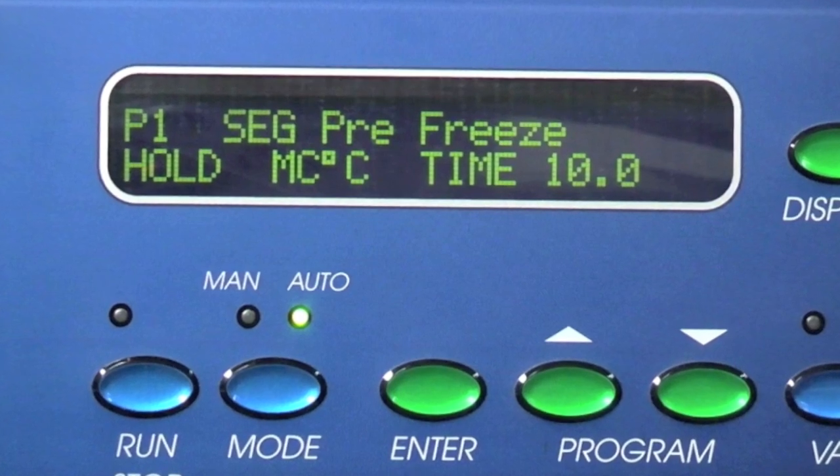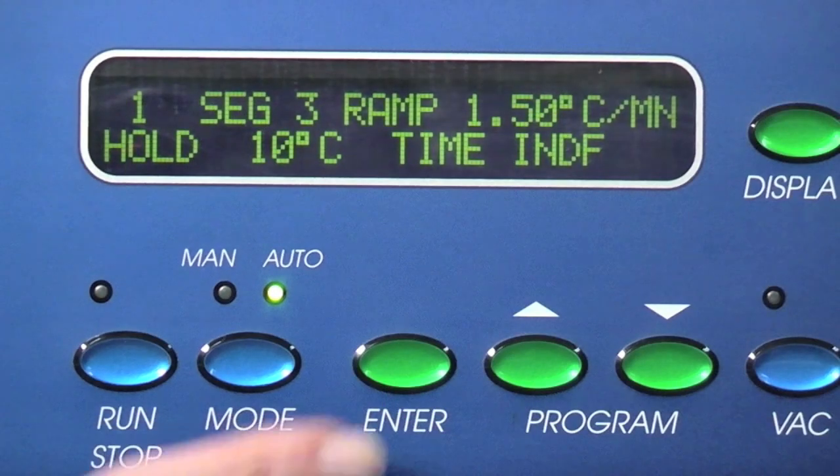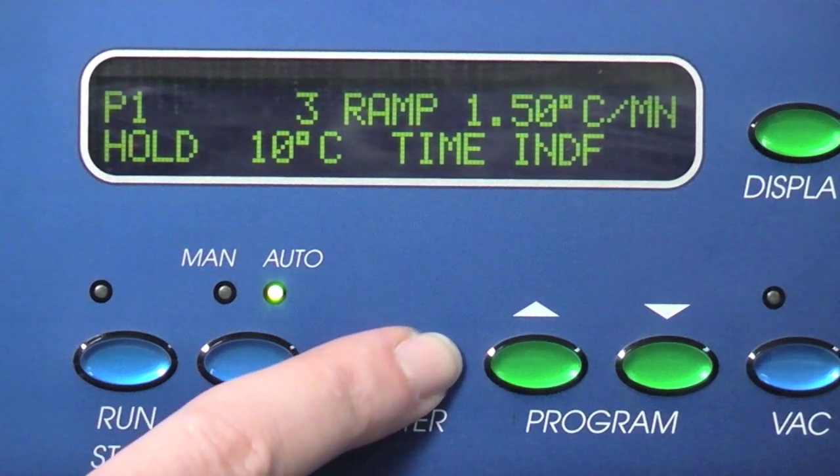The display will show the parameters that were last entered for this program. Push the enter button until SEG is blinking.